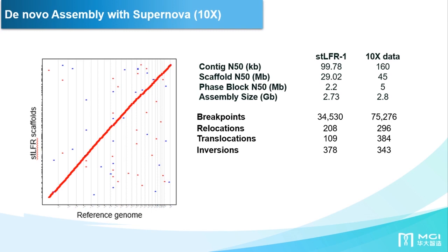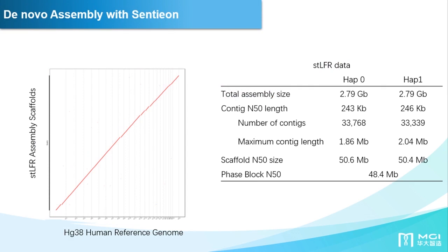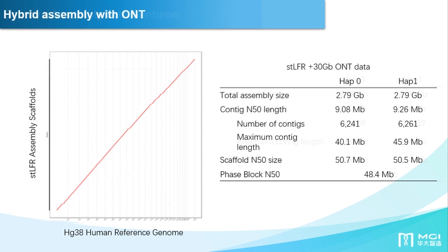And again, this is using purely stLFR. We did this assembly with Sentieon, which involves artificial learning to do the assembly. You can see the scaffold N50s are all well above the megabase level. Earlier I mentioned the hybrid assembly, which we also tried with ONT data. You can see a much more drastic improvement in the contig N50s after we added a little bit of the ONT data as well.